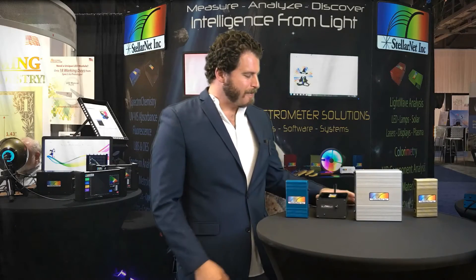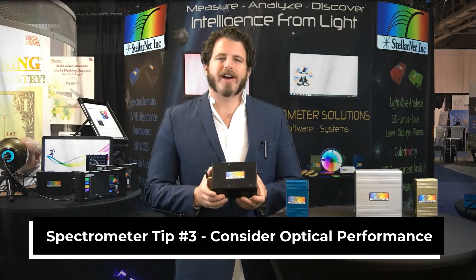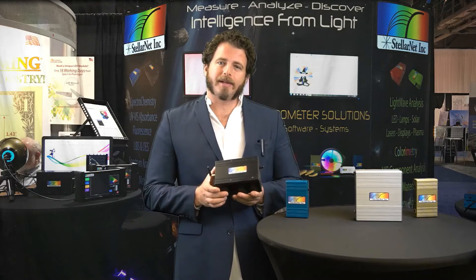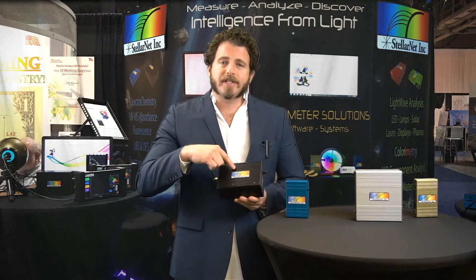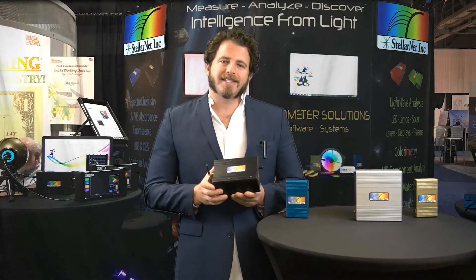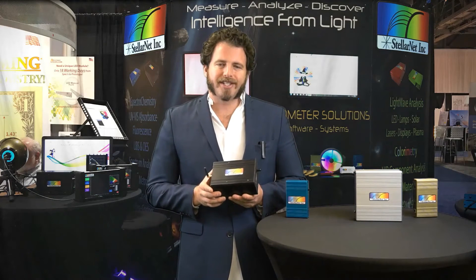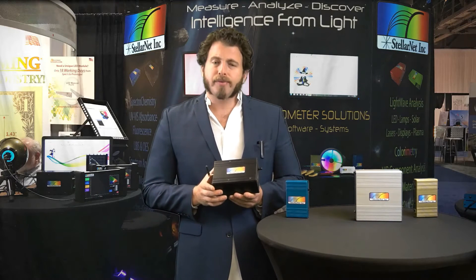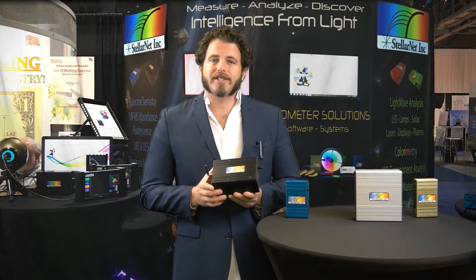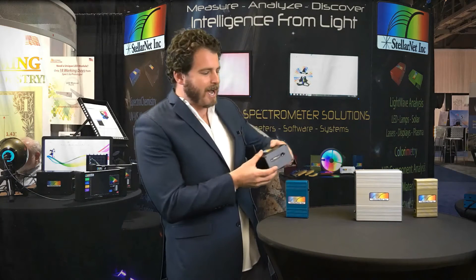Spectrometer tip number three: choose the best optical performance. StellarNet has many different optical configurations, but our most popular is our concave grating spectrometer, the Black Comet. In this spectrometer there is only one optical element — the concave grating itself. Light enters the spectrometer and has one bounce off the concave grating to the linear detector array. One bounce means less light scatter, lower stray light, and enhanced sensitivity in the UV and blue regions as well as the near-infrared. It also reduces aberrations and provides a flat-field wavefront to all detector pixels, giving you uniform resolution across your entire spectral range.